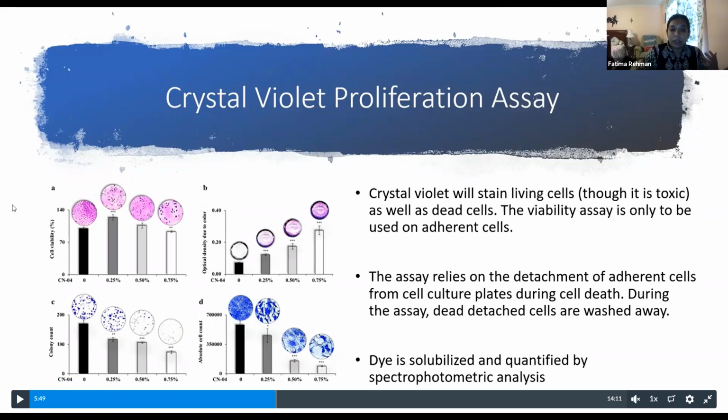This particular image, if you look right here with the A, B, C, D, is what we call a multi-panel figure, like the figure that you will be making this week as well. A multi-panel figure is where you have multiple panels of data, multiple kinds of data combined together in a single figure, all leading to the same final conclusion.